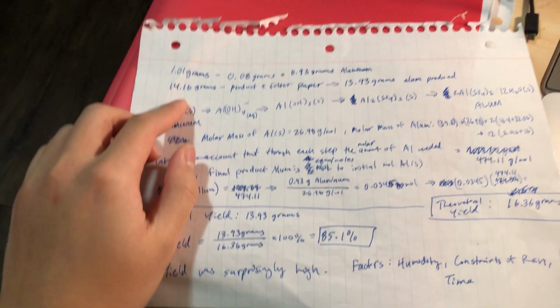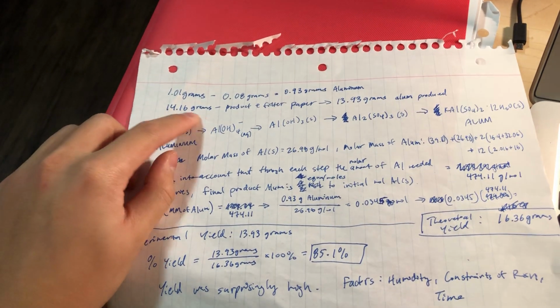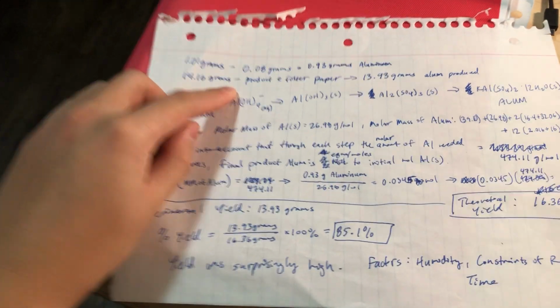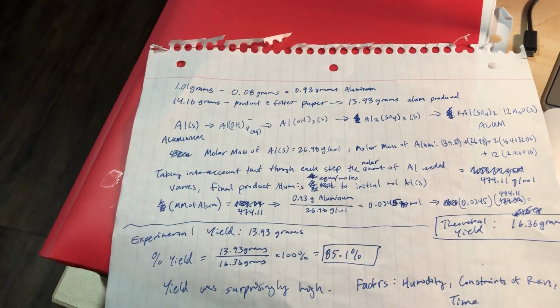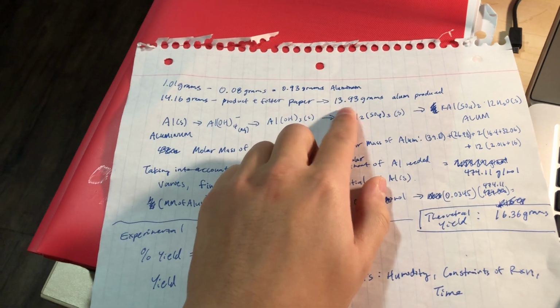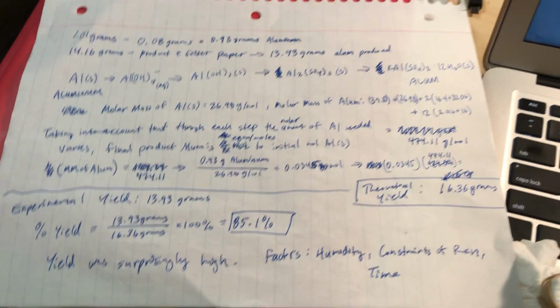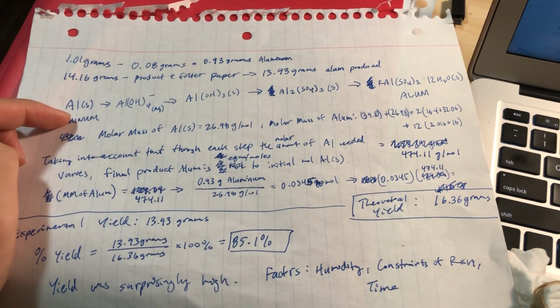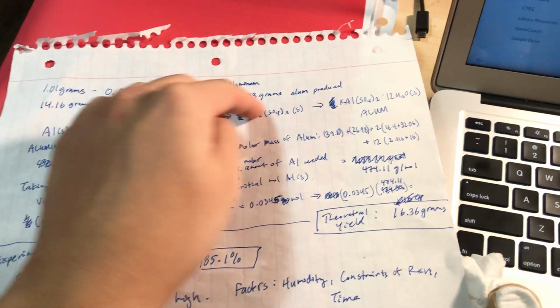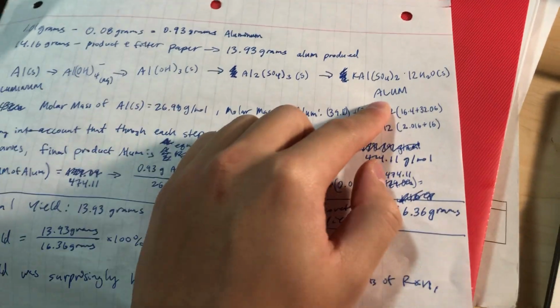And then from that, at the end of the experiment, there was 14.16 grams of alum with the filter paper. So then when we subtract out the 0.23 gram filter paper, we get 13.93 grams of alum produced from this lab. So from the first solid, we go through the process, and the whole process results in this alum, as we talked about in the last video.